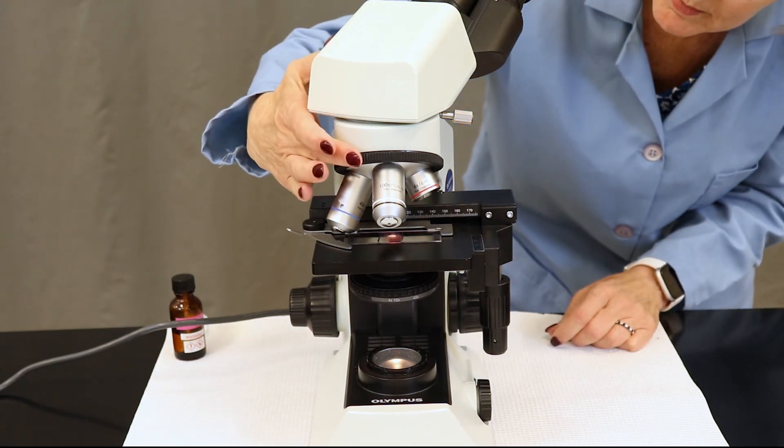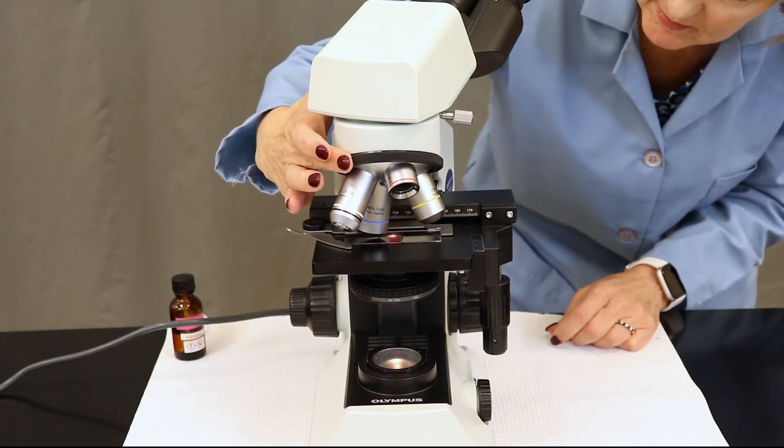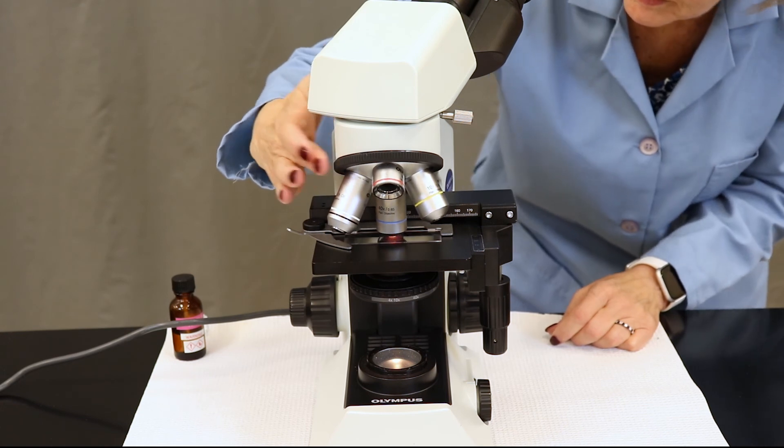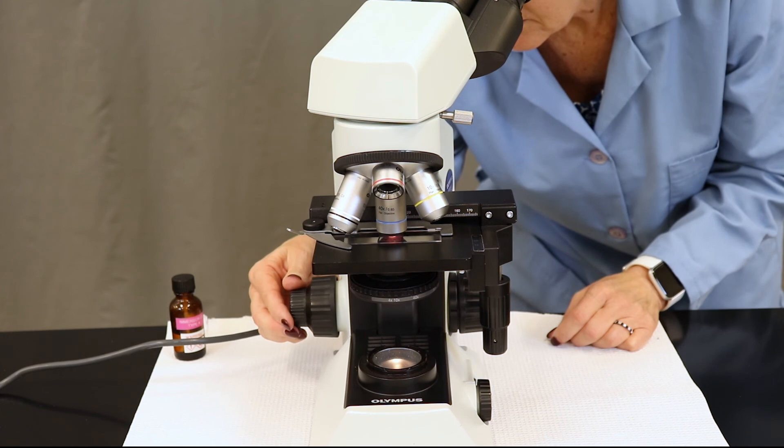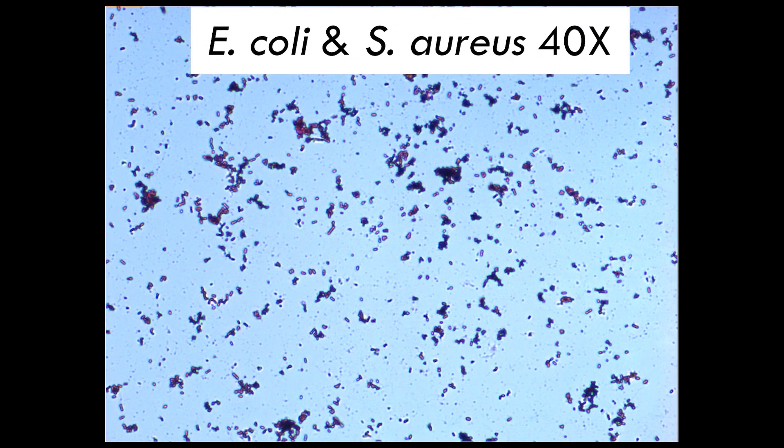Once you see color, use the nose piece and move up to 40x. Here's where you can begin to work with the fine focus knob or the small knob located on the side of the microscope. Adjust in one direction, ideally until coloration becomes clear.